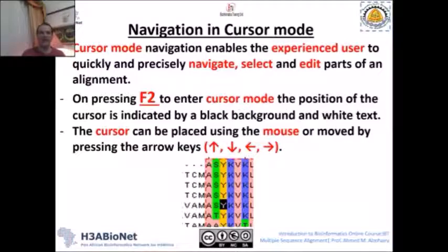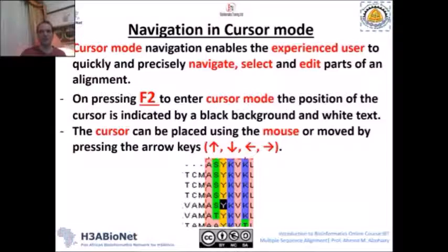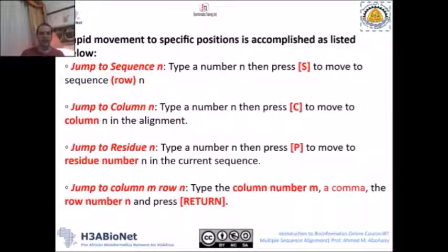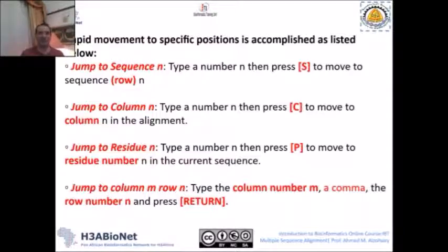In cursor mode you navigate using the arrow keys — up, down, left, and right. To switch from normal mode to cursor mode, simply press F2. To jump to a specific sequence in cursor mode, for example sequence number 5, type the number 5 and then press S. This will take you directly to sequence number N, whatever number you specify.